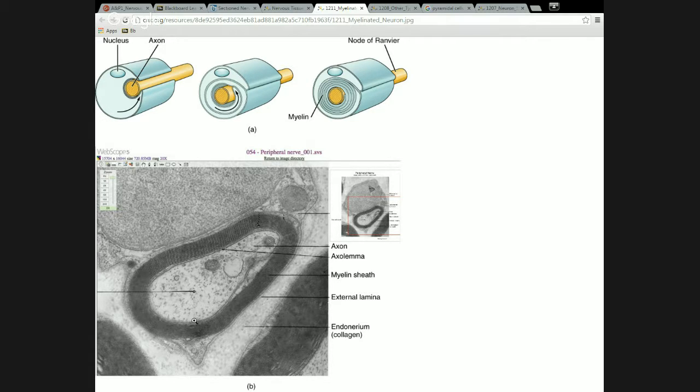The two spots that we see, this one next to the big vesicle and this one off in the corner, those are mitochondria. Mitochondria are very easy to identify in electron micrographs because they have an outer membrane and an inner membrane that's folded up inside of it. If you look closely, you can see a line that defines its outside membrane and then another squiggly line all around inside, which is its inner membrane. Mitochondria are very easy to pick out in this tissue.